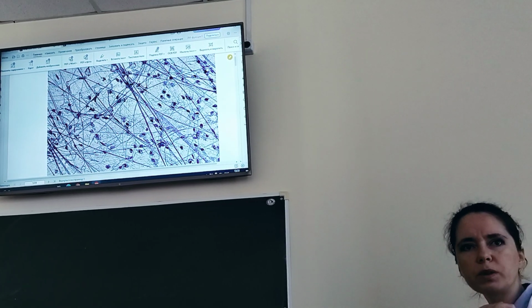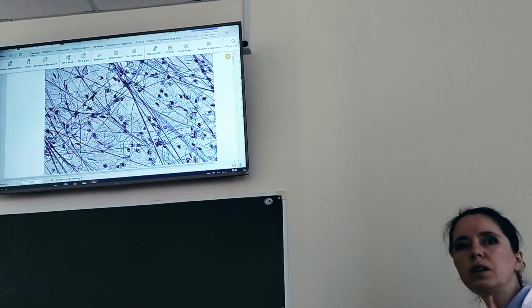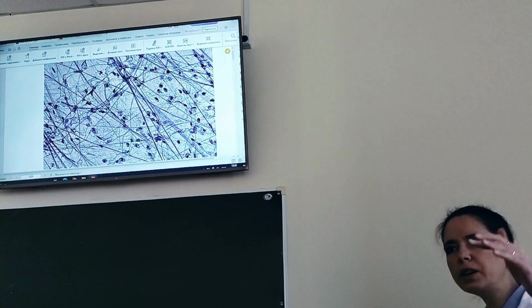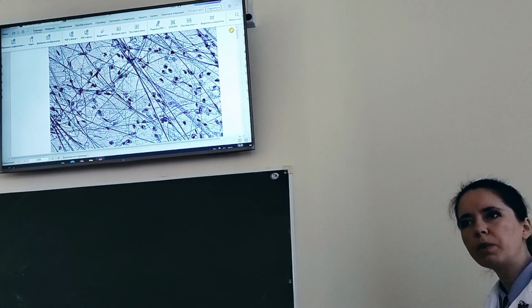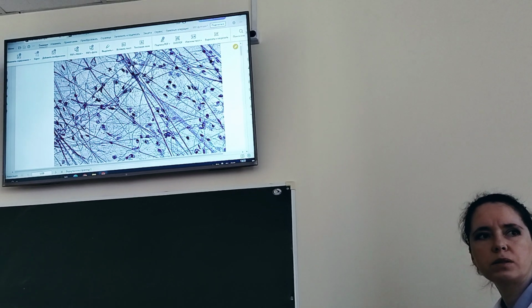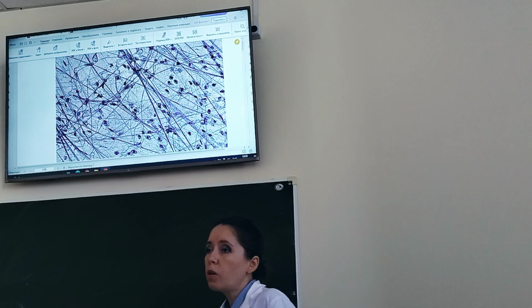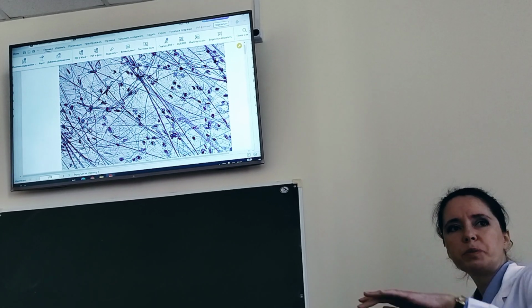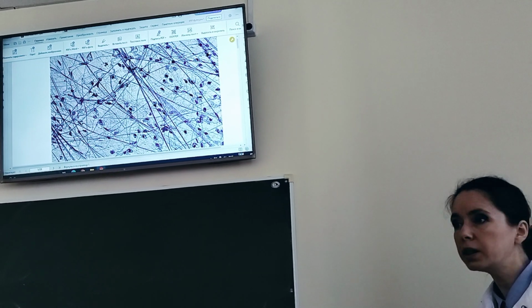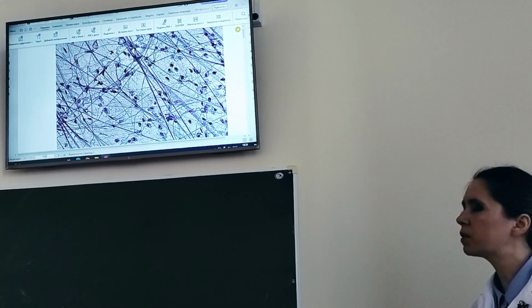And this is the most specific property of loose connective tissue. You remember, predominance of ground substance over cells and over fibers. Then loose arrangement, so irregular arrangement of all fibers. And finally, a not abundant cellular compartment represented by fibroblasts, also loosely organized, without specific direction. That is all that you can see by morphology.